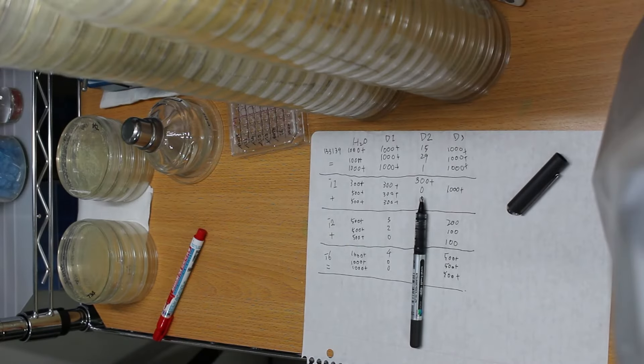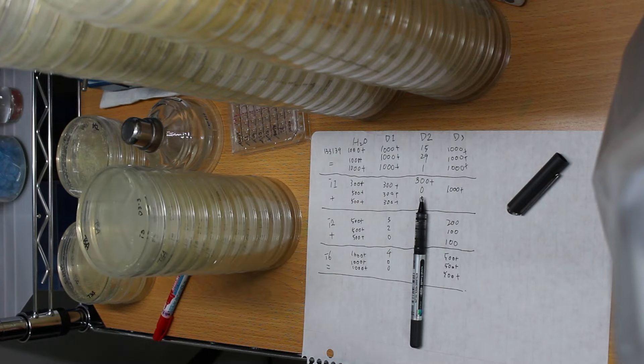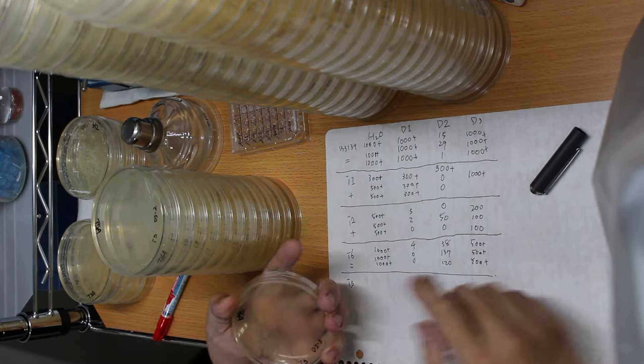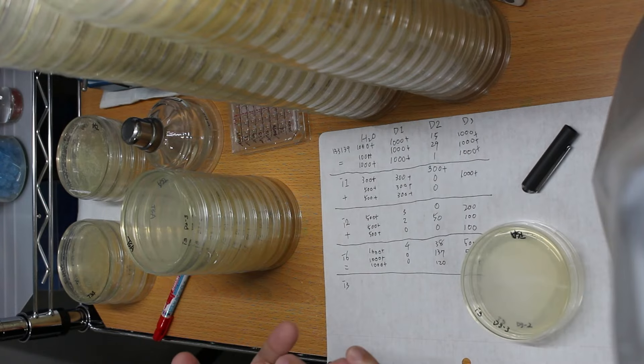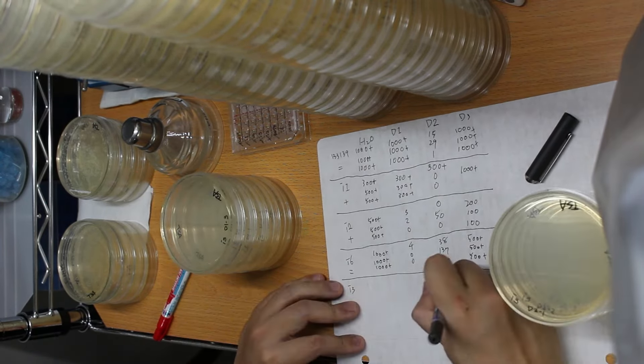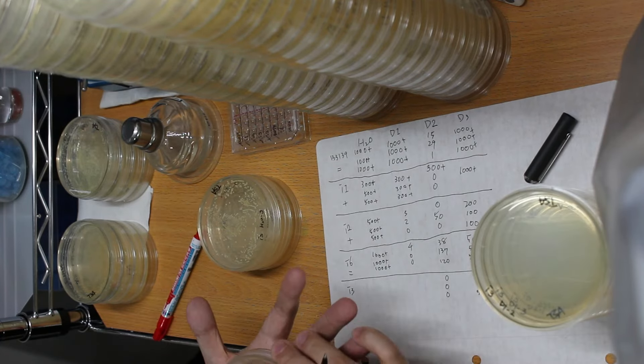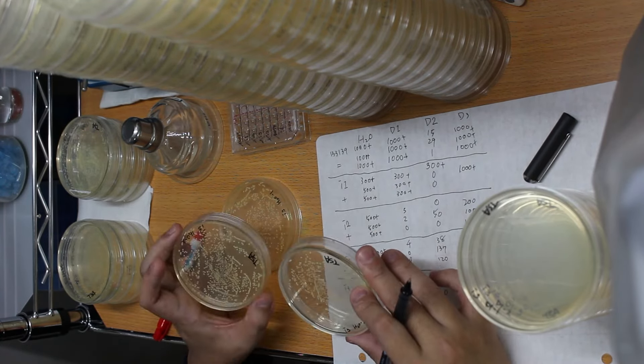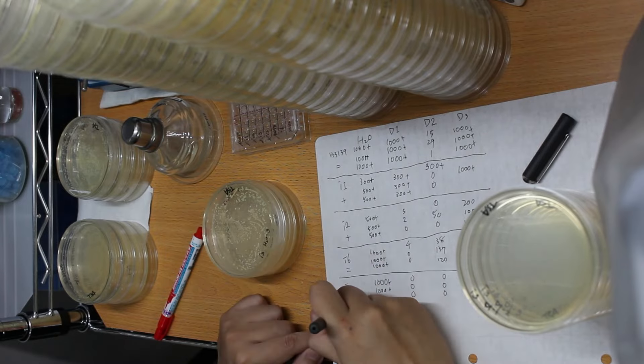And the testing results look like this. And again, because there are so many colonies, I don't bother to count them one by one. Anyway, I turned this testing result that I hand wrote down into a spreadsheet.